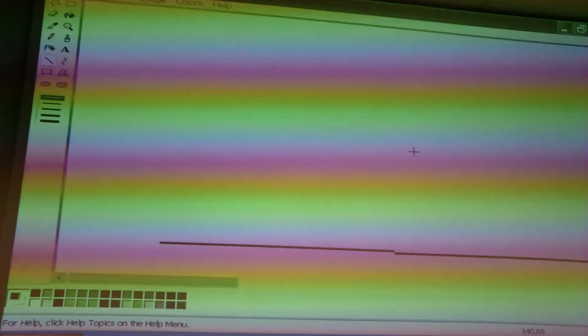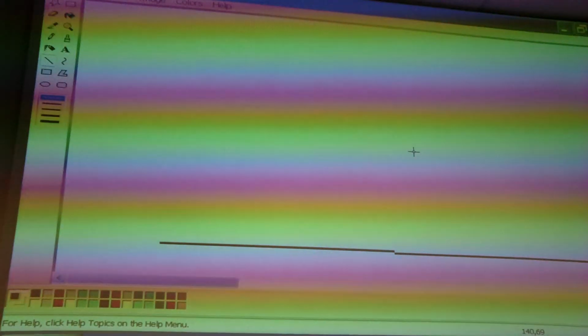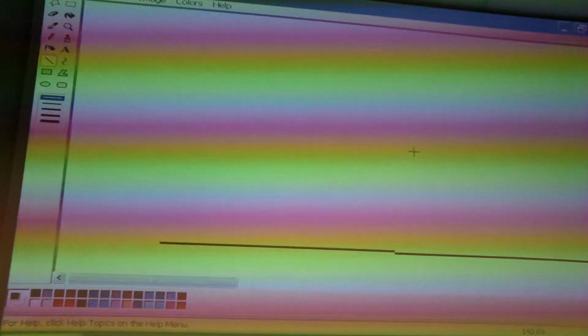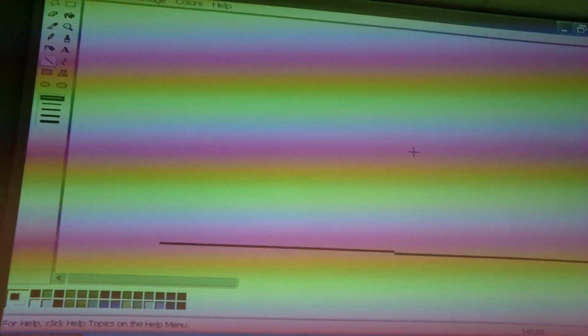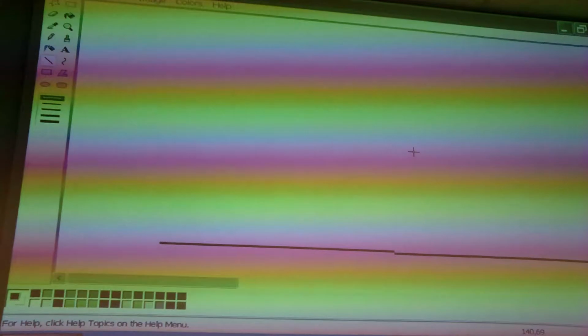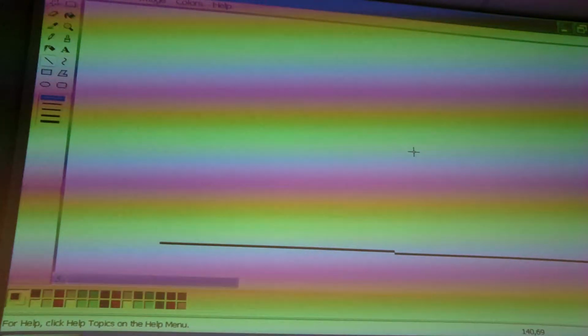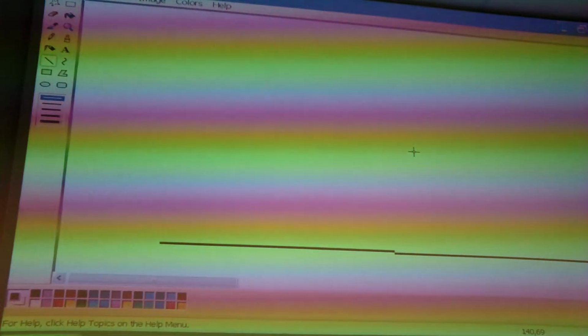What is it? For measuring in a sample that we want to add, what's the next thing we do? Coat. With what? With antigens directly from the culture supernatants? Could that work? So she proposes, which is not a bad idea, it's a decent idea, to add directly the culture supernatants from the cells.